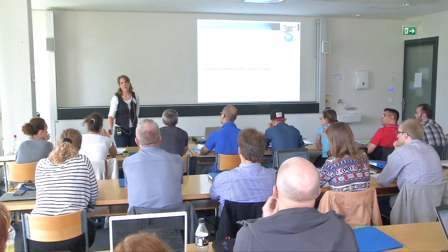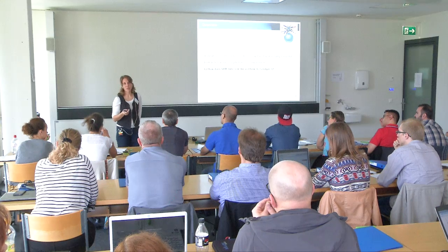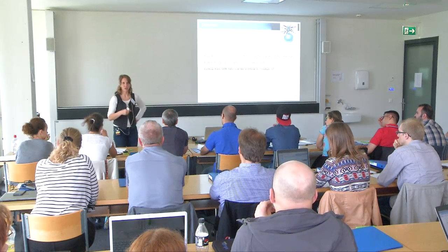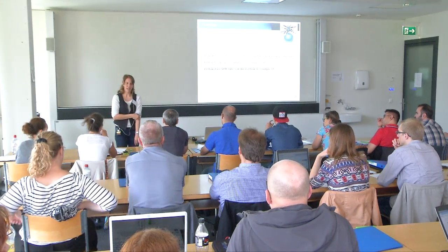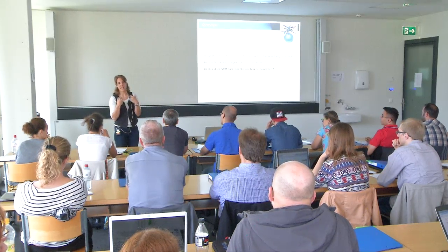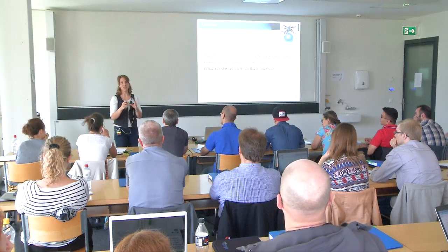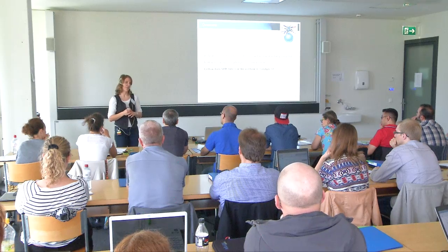And for many cases, this might be okay. However, when you want to be able to differentiate splice isoforms in human or SNPs in human, then you will have to define peptide uniqueness taking into account exactly these things. And you also have these bigger protein databases on NCBI, and then you will have to work with those. So it's very important that you yourself define at the very beginning: do I want to differentiate between isoforms, or is it absolutely okay for me to just report the quantity of a group of isoform proteins, which might also be very okay? It depends on the initial question.